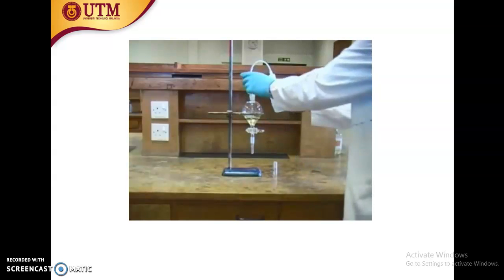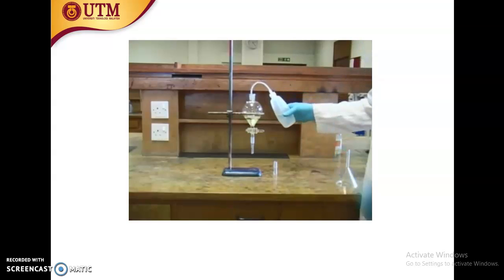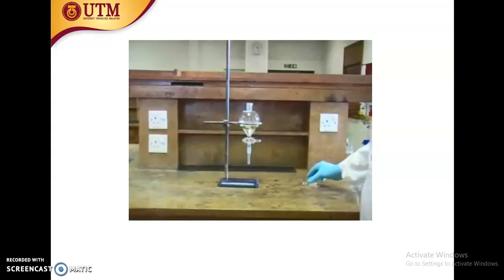Now we add the water which we're using to wash our reaction mixture with. It's important that you pay attention to your script, which may specify a different solvent and a particular volume that you need to work with.